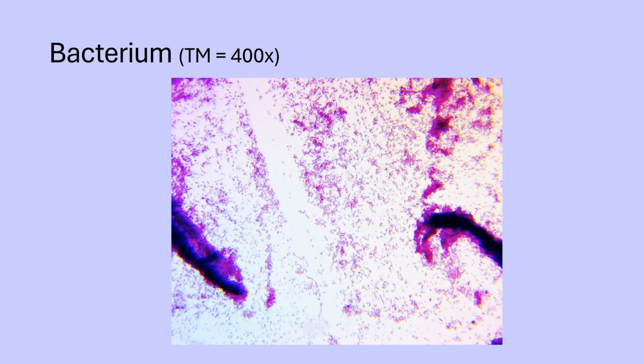No, because viruses are so small, you cannot see them with a compound microscope. You would have to have an electron microscope, and we don't have those. Those are very expensive. It takes a lot of training to learn how to use them. So we just have the compound scope.